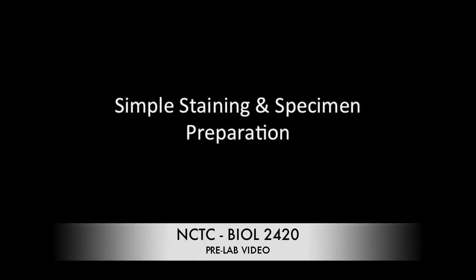In your next lab session, you will be learning how to prepare a specimen for staining and will perform several staining techniques. The samples you prepare will be examined using the compound light microscopes used in the lab.